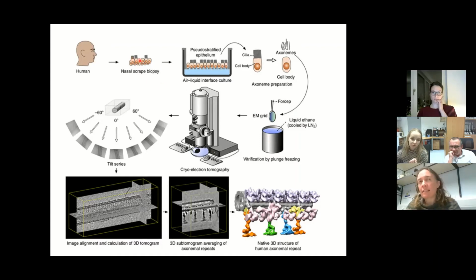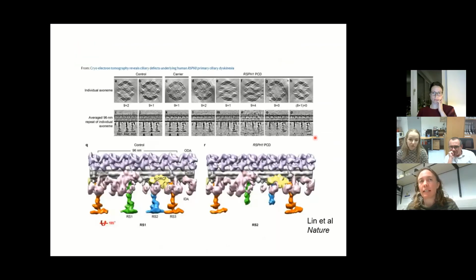And as well as doing the tomography technique, they also use cryo-electron microscopy. And cryo-electron microscopy means that you're not limited by those chemical stains that we usually use, the heavy metals which reflect the electrons, and also by the agar and the araldite and things that we use in chemical fixation. So that improves the resolution in that way, and then the tomography also improves the resolution, and you're able to build a much better picture of what's going on in the cilia.